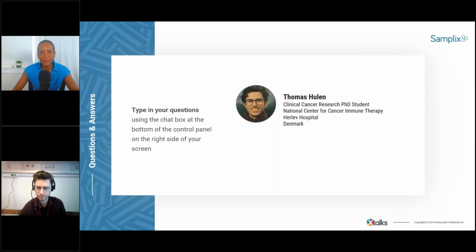Okay, all right, thank you for that explanation. We'll go to the next question here. This audience member is asking, can you speak to the cell viability when encapsulated in the droplets?